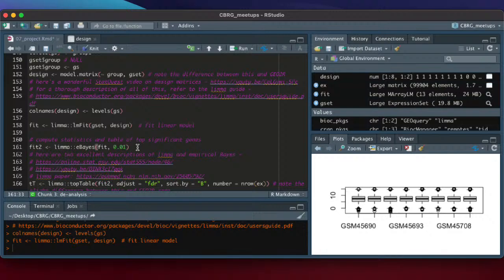And that's because what it's doing is working out some kind of average. It calculates the mean of all the variances in your entire gene set. So that's one value. And empirical Bayes calculates some kind of average between that value and the measured variance.